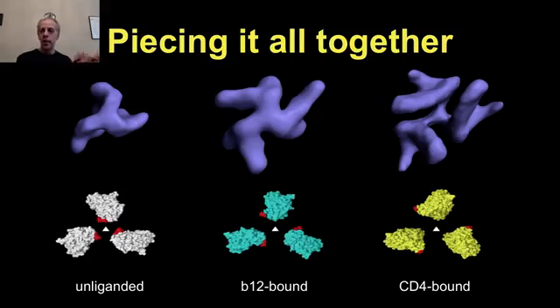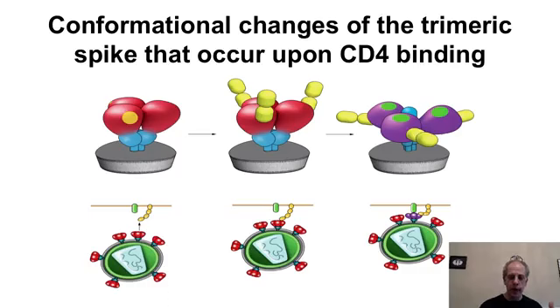And this is what the people from biology teach us. That is the important part. Why are we doing this? They come and explain. Because now I can look at the HIV envelope under different states and see that their shapes are different under different states. And then you can start making biological conclusions about that and say, under a certain conformation, this is what happened; when it's latching into the CD4, it's changing shape. And that's extremely important for the vaccine development people.